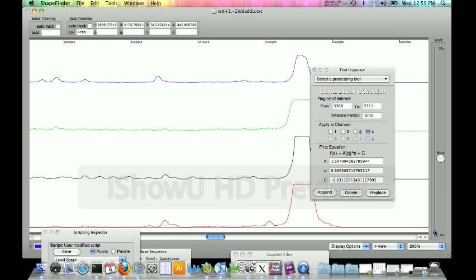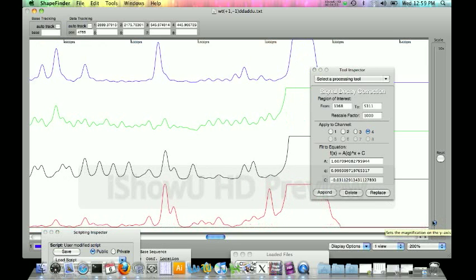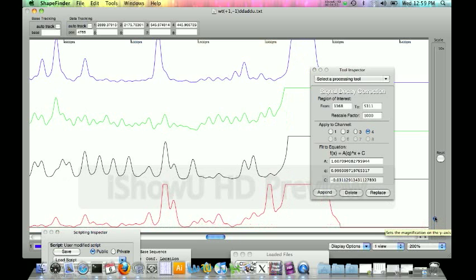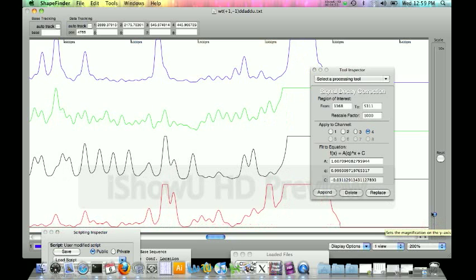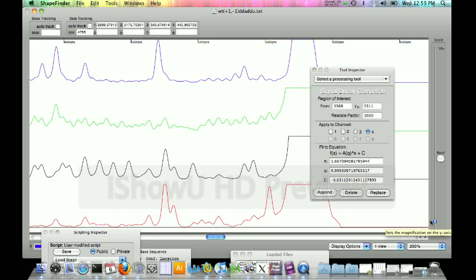Everything seems to be on a pretty good intensity level. Everything's pretty much there. So you can play with this scaling issue here. Depending on how tall you like your peaks, you can adjust it however you like.